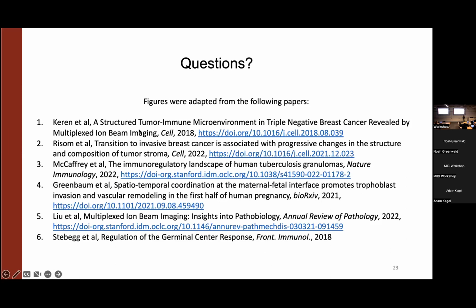So the question was, how do you integrate Pixie with the spatial analysis? So the output of Pixie is directly inputted into this analysis because Pixie is where we get the phenotyping of the cells. The pixels themselves, we don't take into account. We're just looking at overall what is the label that is associated with the cell. And it could be a cell phenotype from Pixie, but it can also be other things, like any type of label that you can put on your cells would do. It just really depends on what you're trying to figure out.